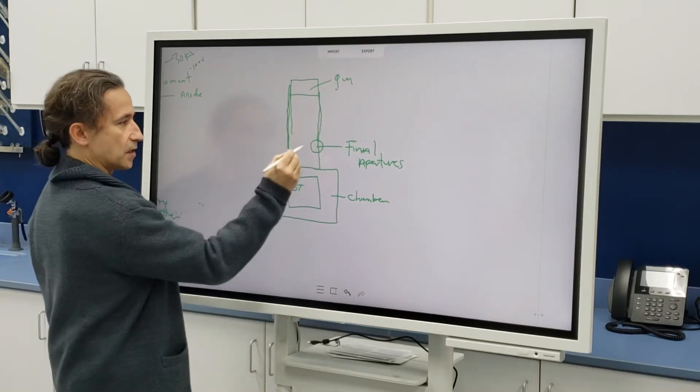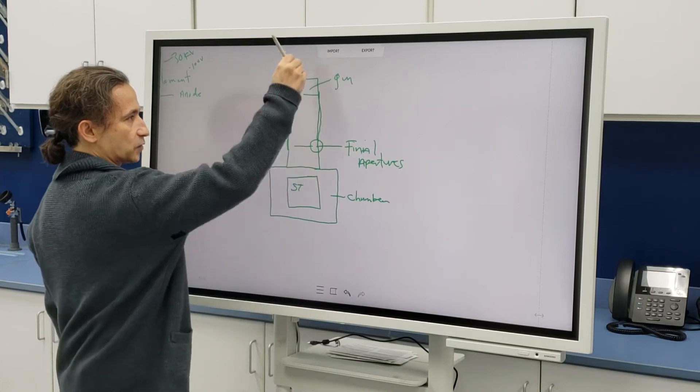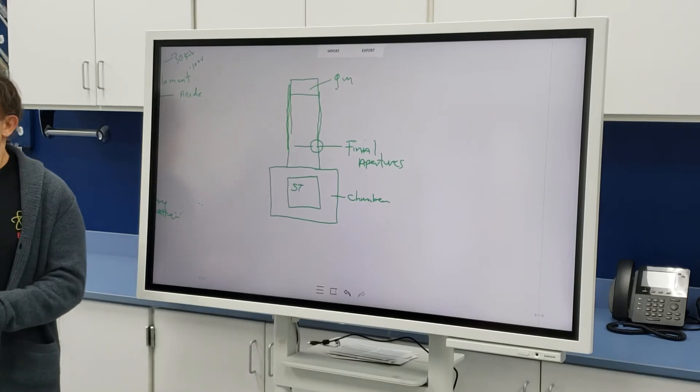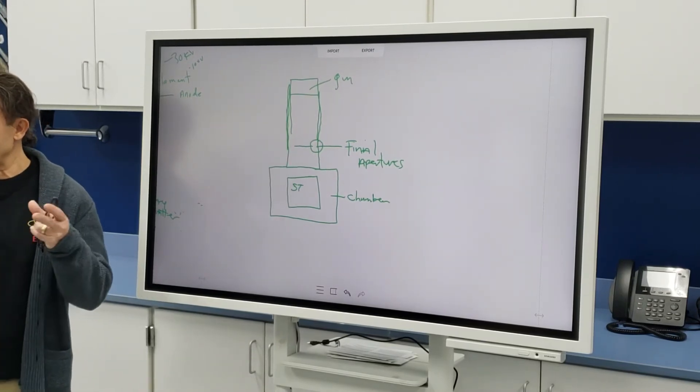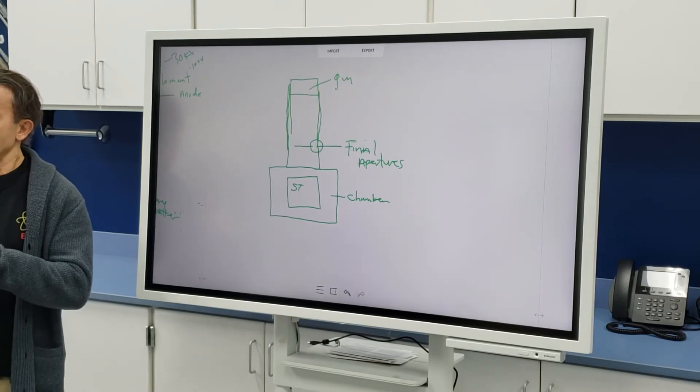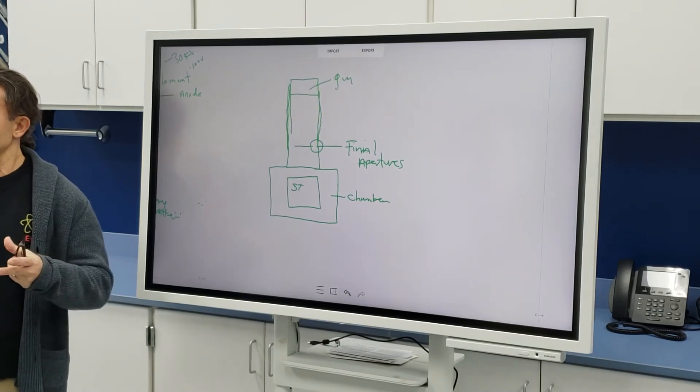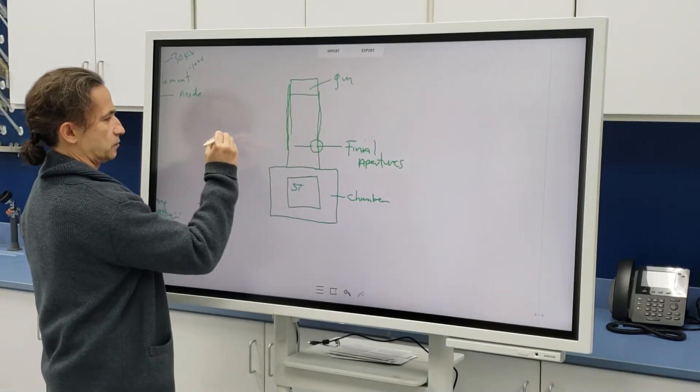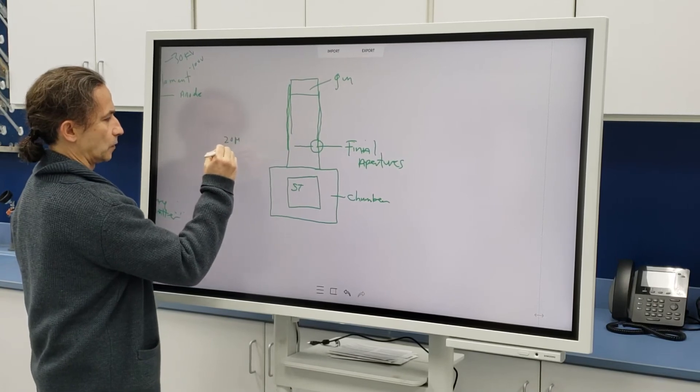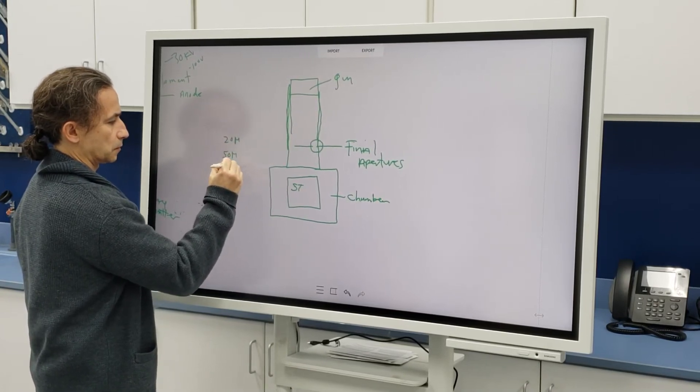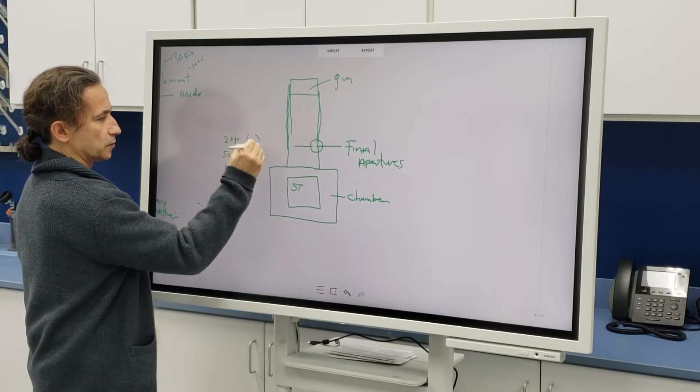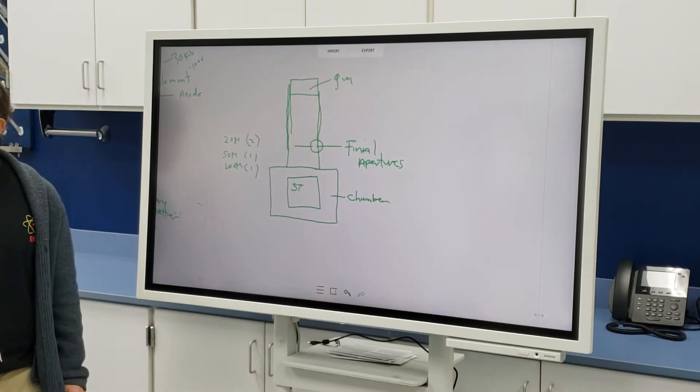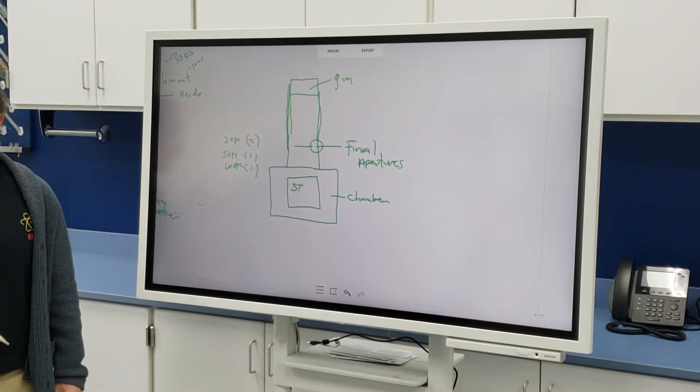It holds four different final apertures, and that gets inserted through the center of the column. As the beam comes down, there's four different diameter apertures of the beam developing for the same reasons as, hey, I want a smaller beam to get a denser lens. Can't get the beam small enough to get the resolution I want, or I may want a larger beam to do my x-ray count. We have four selectable final apertures, and they are two 20-micron, one 50-micron, and one 100-micron aperture. I leave it as small as I want, 20.